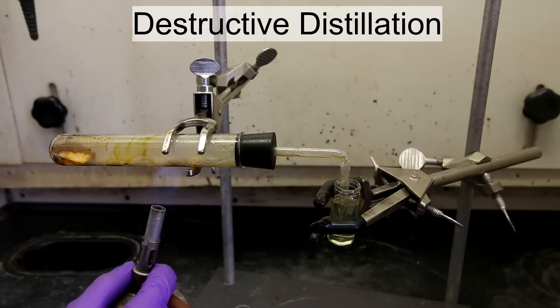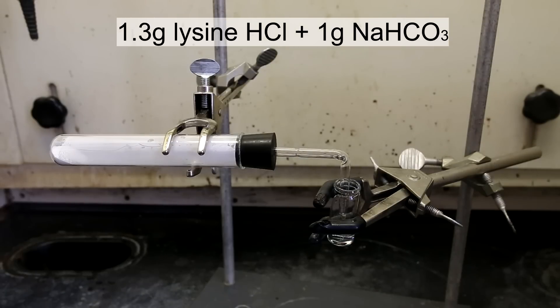Next is the destructive distillation method, which is a much more efficient process. This is an improvised destructive distillation setup that I made. For this run I used 1.3 grams of lysine and about 1 gram of sodium bicarbonate.